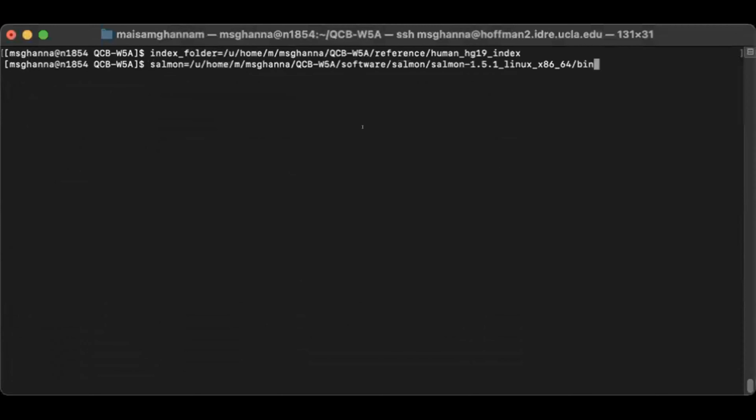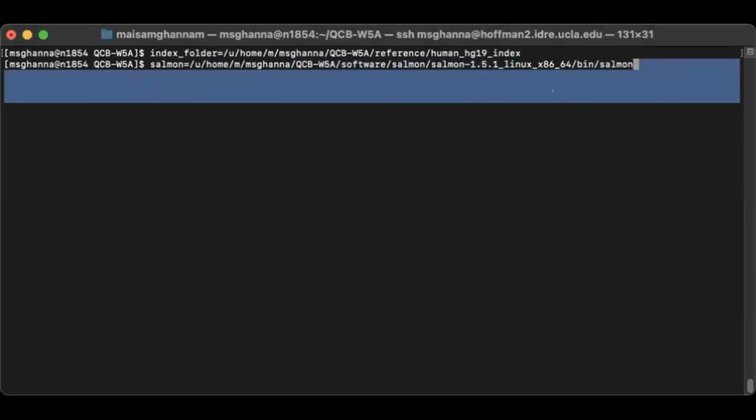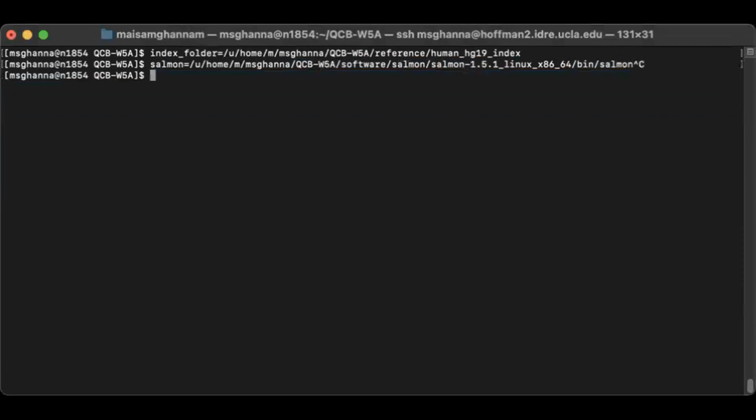Okay, so here, let me rewrite the salmon portion of it so that it's listed. So this is what it should look like. Yeah, but then /salmon at the end as well. So salmon after software, and salmon also after. So remember, each slash, if it starts with a slash, it's a directory. Okay, so here, let me try this one more time. I'm sorry, it's hard to visualize this.